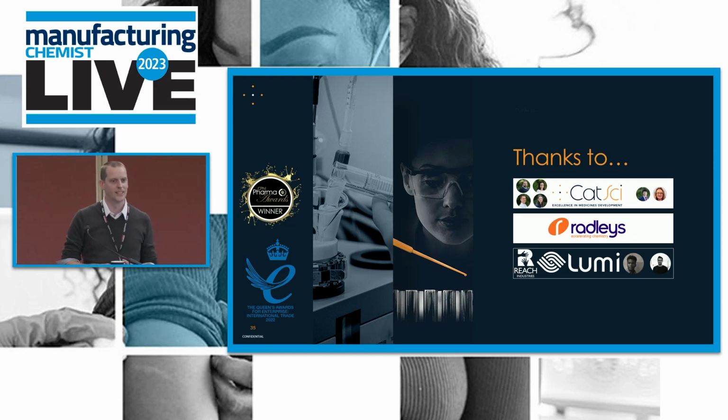Very interesting, especially with the Lumi imaging technique. With regards to the turbidity measurement you showed, as well as the colors, how confident are you that the turbidity is actual turbidity and that the color is the actual shade of color? Because you have light and other factors, and turbidity measurements are useful, for example, for the stuff we do when it comes to solubilities. I want to learn more about that if possible.